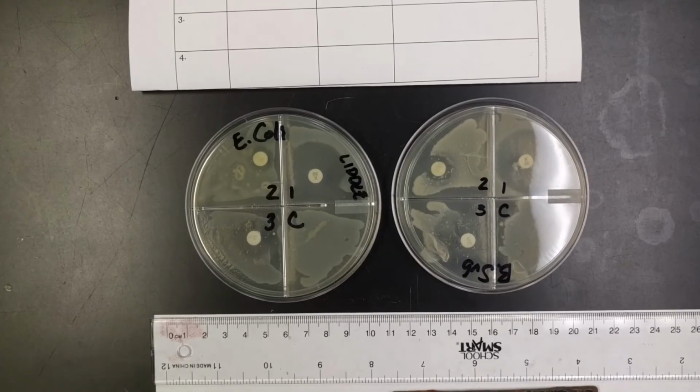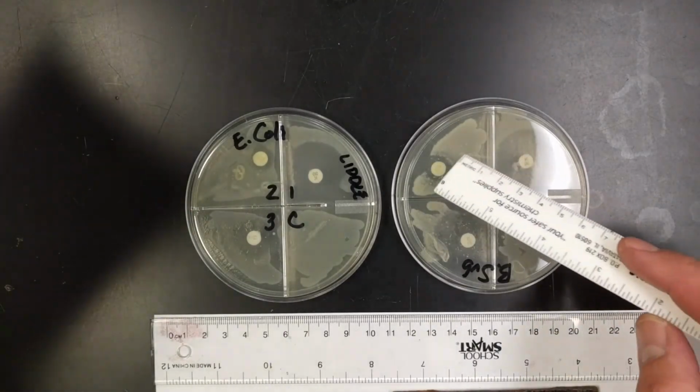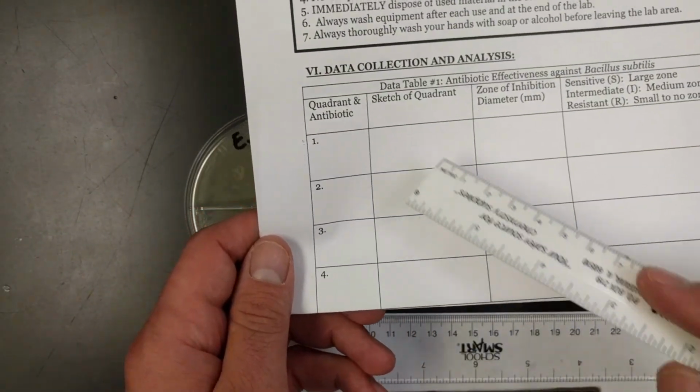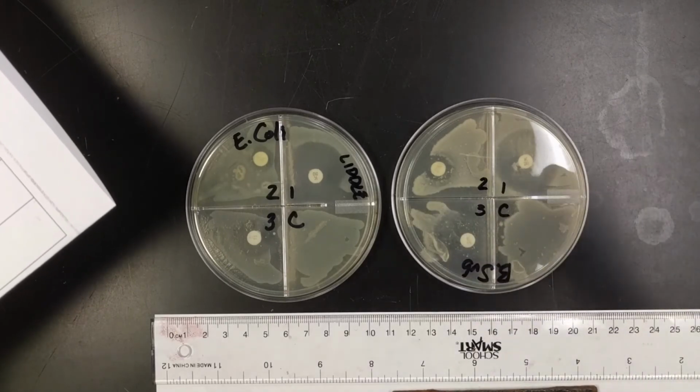All right, it's data collection day. We have our E. coli plate and we have our Bacillus subtilis plate. We have quadrants 1, 2, 3, and 4 for the control. So we got our 1, 2, 3, 4 quadrants. A sketch. So sketch me out what you see in each quadrant. Or alternatively, take a picture like we have here.